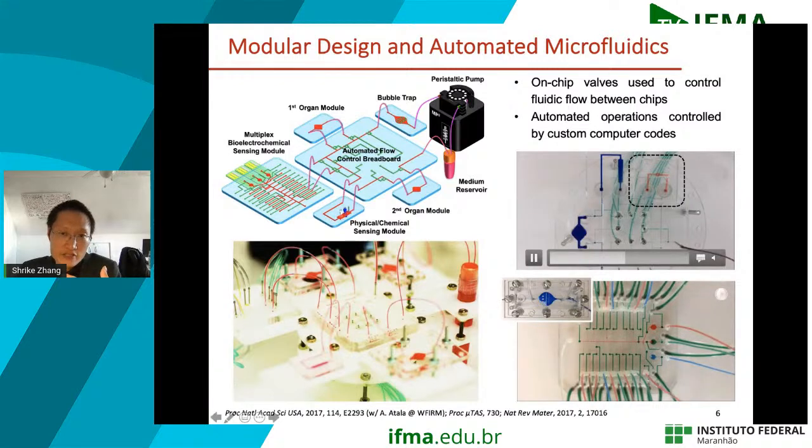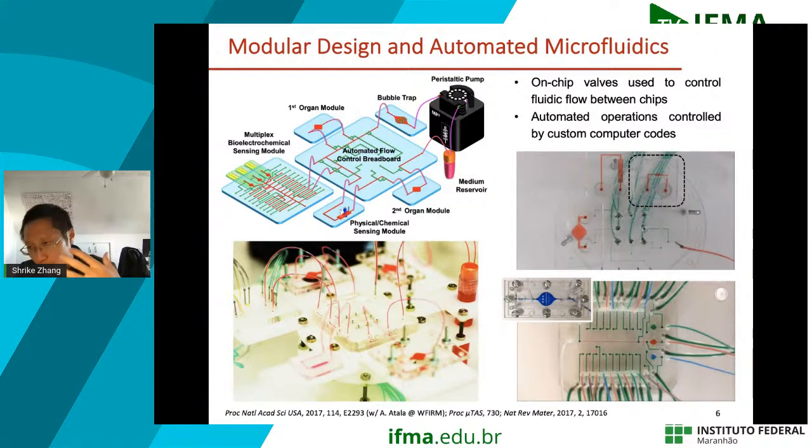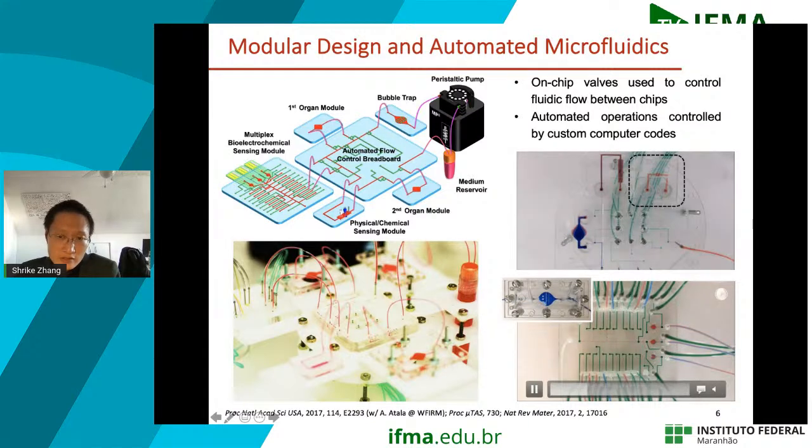For example, in the movie shown on the right, you can see that these two compartments are continuously perfused. And the third module here is isolated completely until you open these valves. And now you can see the flow of the liquid into the third module, right? So again, everything is tightly controlled on the chip. You can really determine when the liquid is going to which module in a very precisely defined way. And you can also expand this complexity to a pretty high level. Here is a chip that has over 30 different channels, and everything you see here is basically automatically programmed.